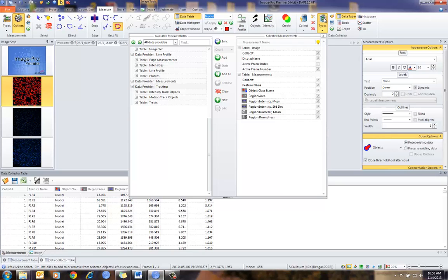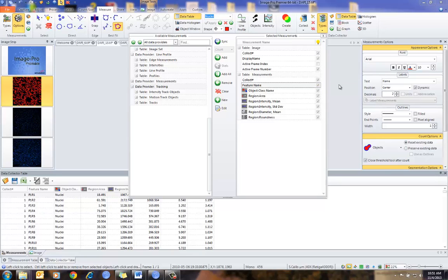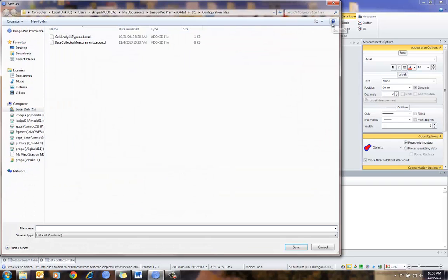I can add or change this information. I can choose what information to show or not show by simply turning off these check boxes. The important thing now is I want to save this. If I have this set up correctly, I want to simply save this table or this setup. I'm just going to give it a name, call it Nuclei Data Collector, and then save that. You'll see that it puts its own extension underneath it.